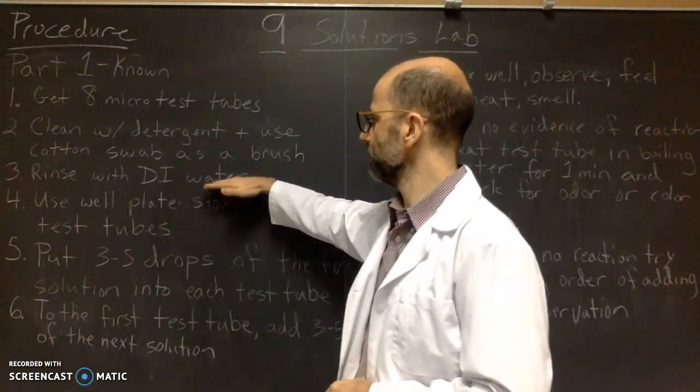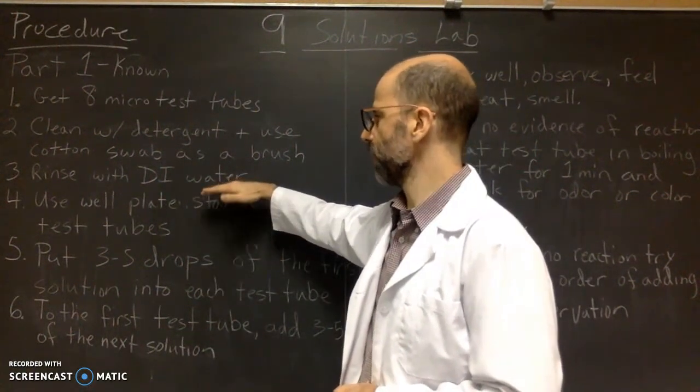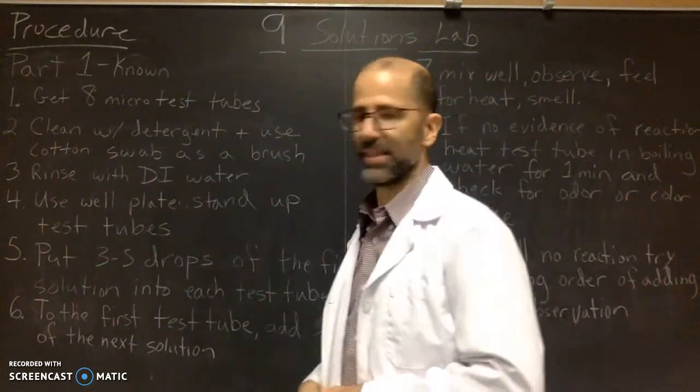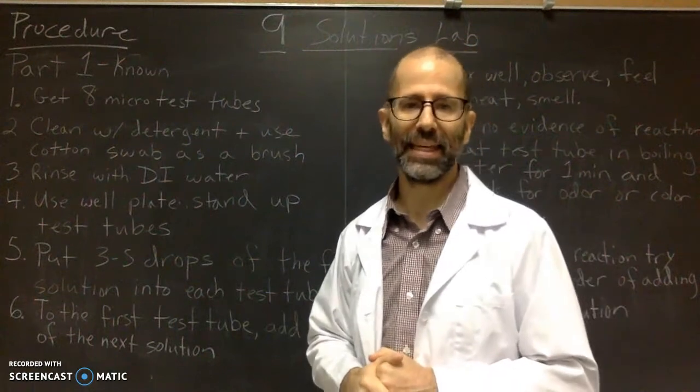So you're going to rinse your micro test tubes out with the DI water after washing them. And then you're going to use your well plate as a stand. You're not putting anything in the well plate.